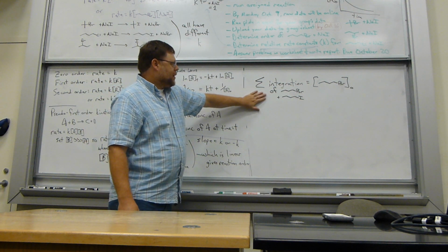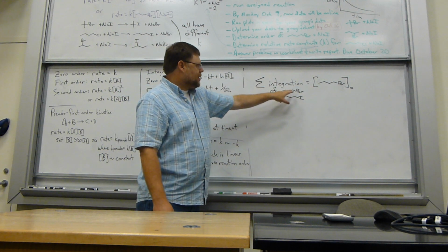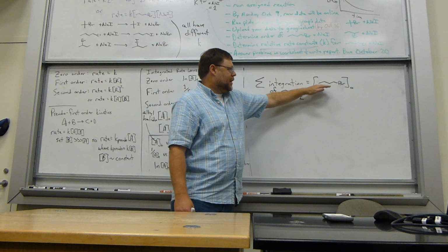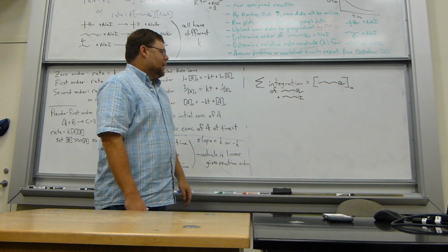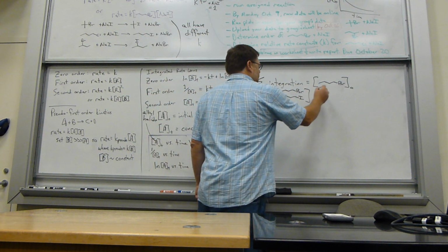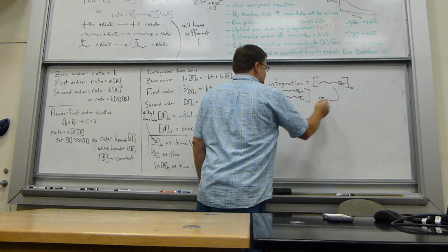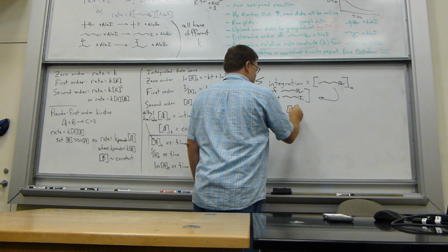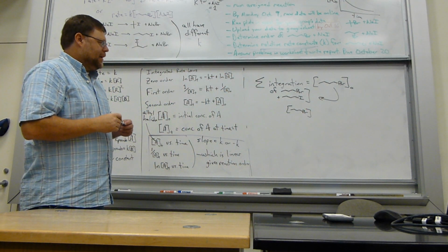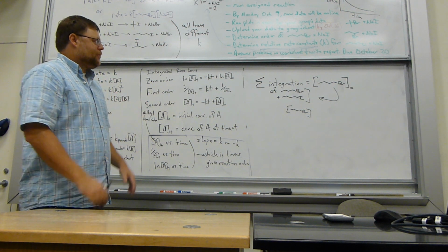You're going to use this equation. The sum of the integrations for n-butyl bromide and n-butyl iodide has to equal the initial concentration of n-butyl bromide. So you'll sum these up and get that, and then feed that back in here to give you the concentration of n-butyl bromide at time t. And that's what you use to plot. That's going to be A in these reaction rate plots.